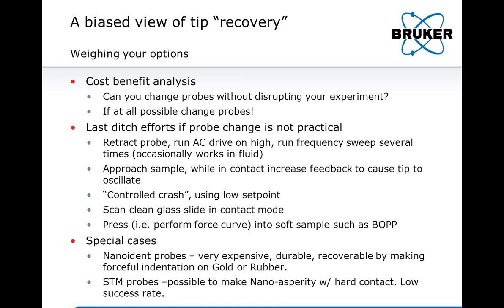As a last-ditch effort, if probe change is not practical, some methods that have occasionally been shown to work would be to retract the probe, running the AC drive at a very high frequency, and sweep several times, and this occasionally works in fluid. You can approach the sample while in contact, increase the feedback to cause the tip to oscillate. We can perform what is called a controlled crash using a low set point. We can scan a clean glass slide in contact mode, or press into a soft sample such as BOPP.